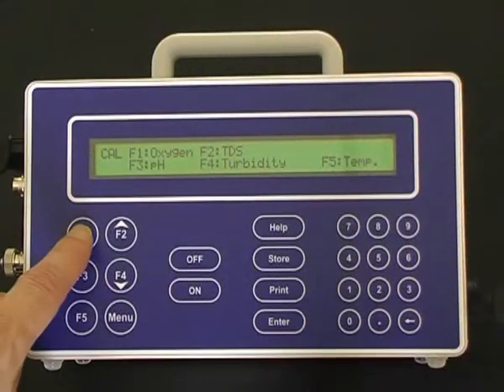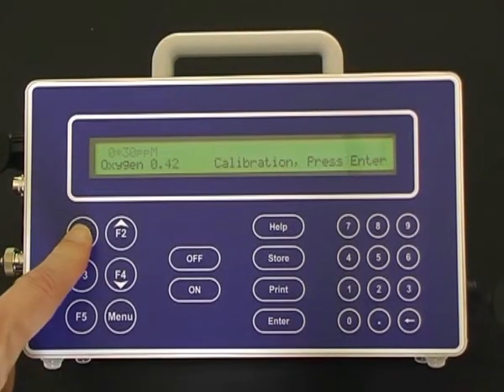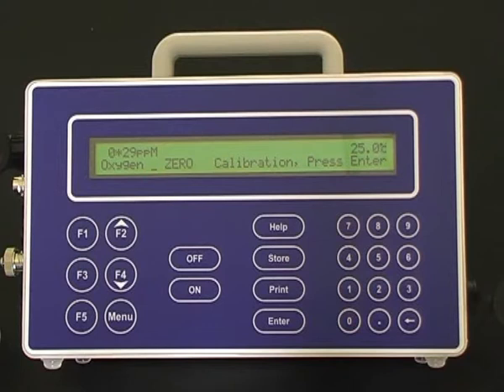Press F1 to calibrate oxygen. Allow sufficient time for the dissolved oxygen sensor to equilibrate to zero. This may take three to five minutes.